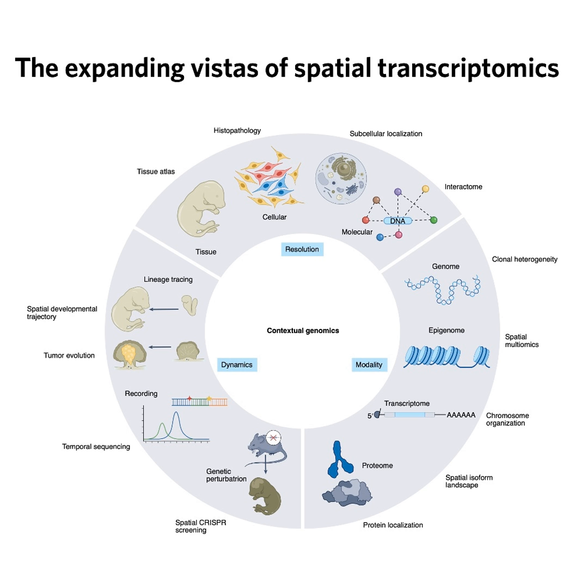Okay, multiple rounds. But how is the RNA actually labeled or detected in the first place in these methods? What are they actually imaging? They generally use 3 main ways to visualize the RNA. First, there's direct probe-based detection. This is basically an enhanced version of a classic technique called single-molecule FISH, or smFISH. You design many short fluorescent probes that all bind along the length of a single RNA molecule. Together, they create a bright, specific spot you can see under the microscope. Okay, lots of little lights make one bright spot per RNA.